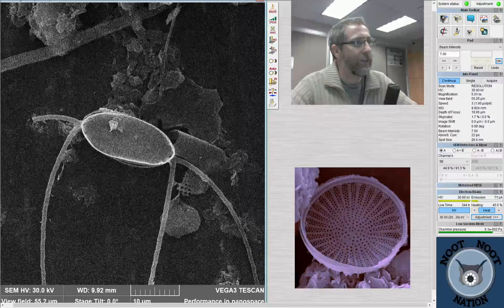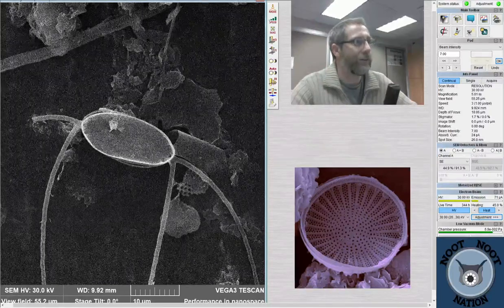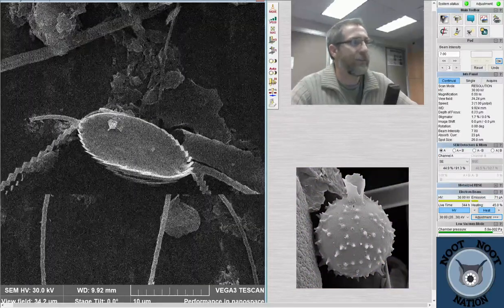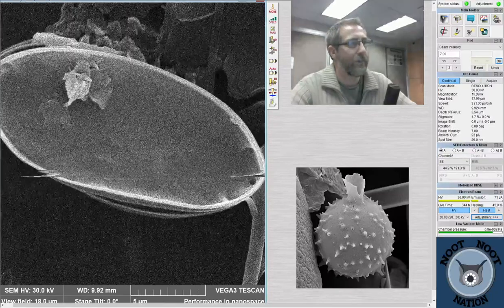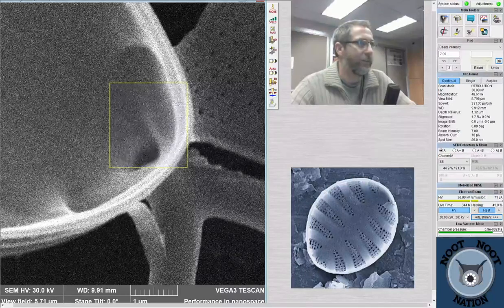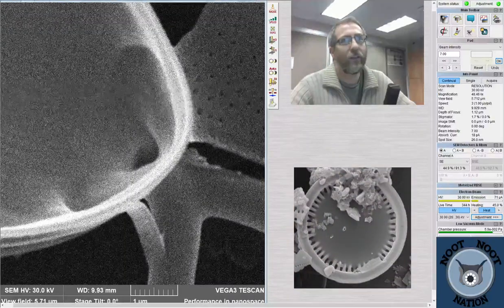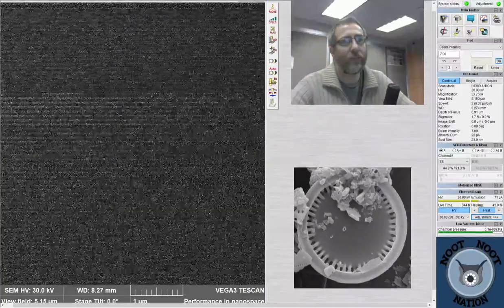And we don't have much of a chain to look at. We're just looking at one. But it's kind of neat to be able to look inside of it and sort of see that. You don't usually get to see such a nice view of the inside of one of those spines. And that structure clearly defined. So you can see why we do call them something that isn't spines. I'm going to move us up even a little closer.